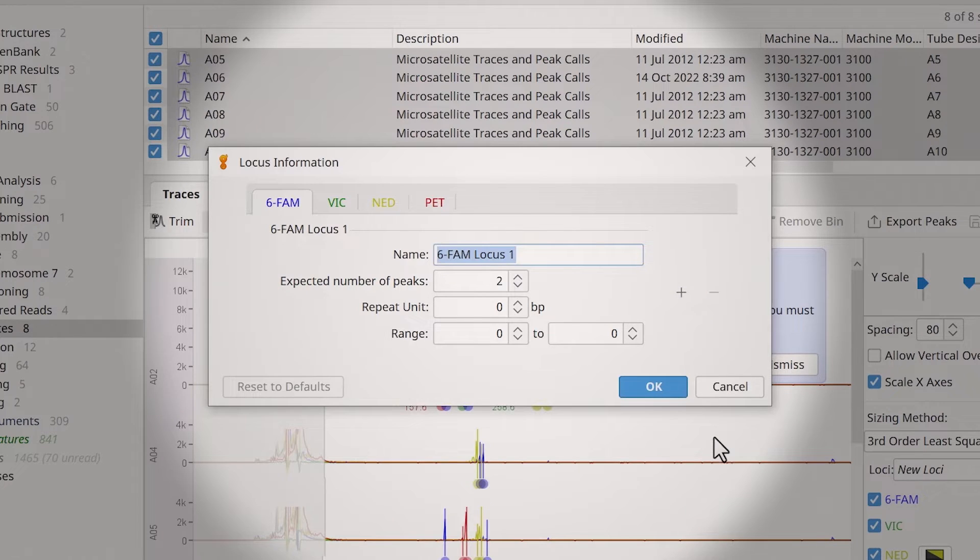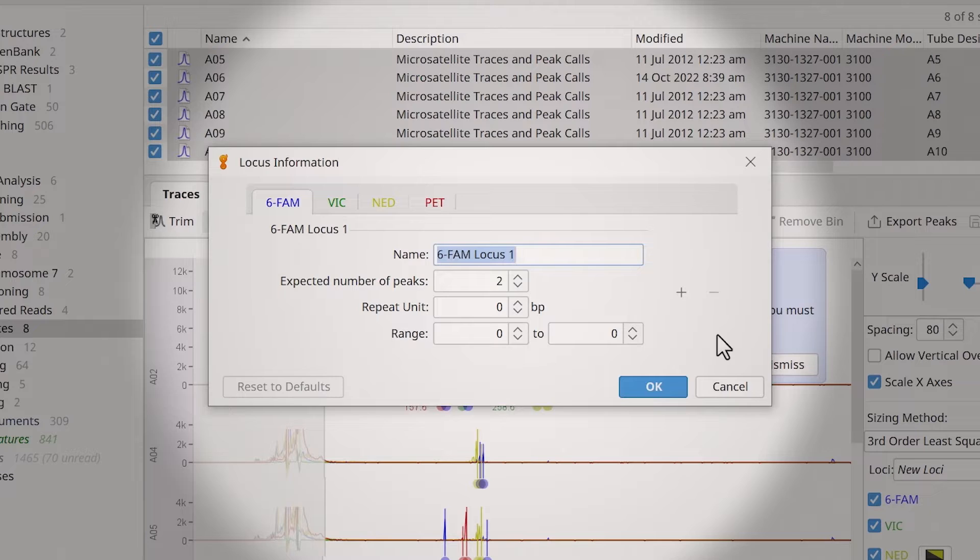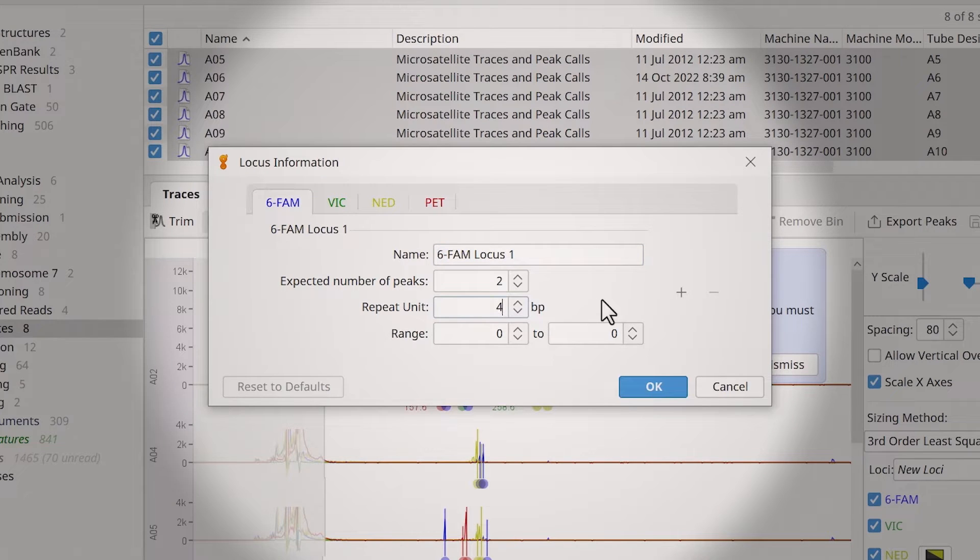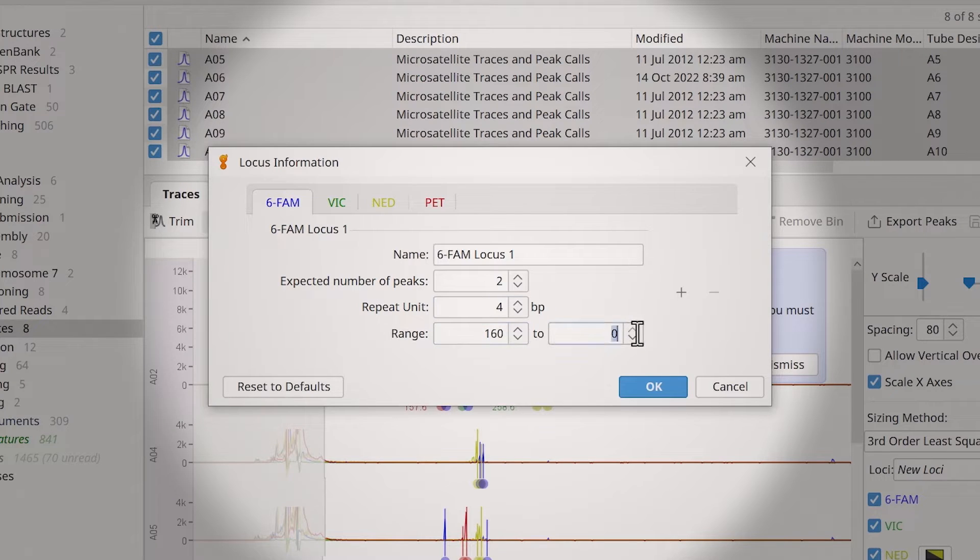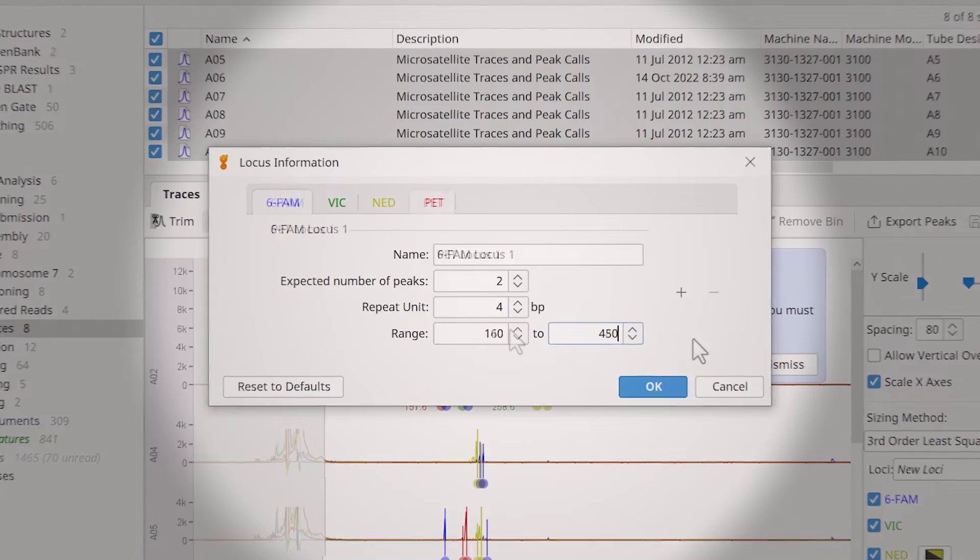For this example, the expected number of peaks is 2 and the repeat unit is 4. For the 6-FAM dye, the range is 160 to 450. Ensure you adjust the settings for all dyes you are using.